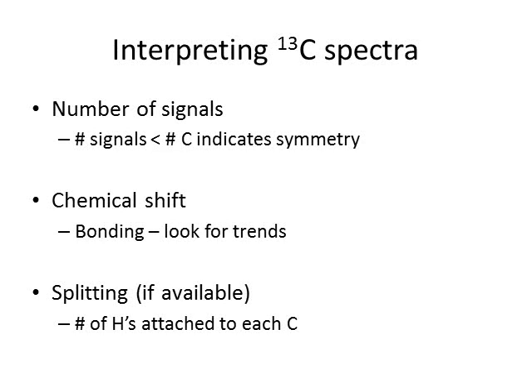But when there are strongly electronegative elements nearby, the signal will be shifted to the left. So a C-O bond, which is a carbon connected to the second most electronegative element, will come very far to the left, around 65. On the other hand, a carbon attached to a nitrogen will give a signal that's not shifted quite as far. Other elements as well.